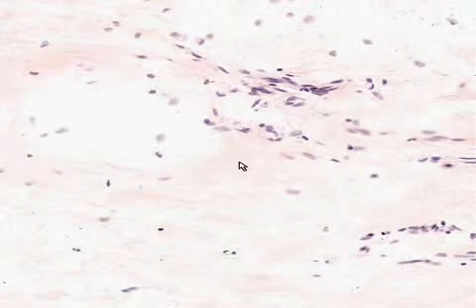If the cell is round, the most likely cell it is would be a lymphocyte, especially if it has minimal to almost zero looking cytoplasm. If the nucleus, for example, is eccentric, like you see here, that's more likely to be a plasma cell, although there are other classical features of plasma cell. If the cell is likely to have a darker, more granular cytoplasm around the round nucleus, that's more likely to be a macrophage. That's most likely a macrophage.